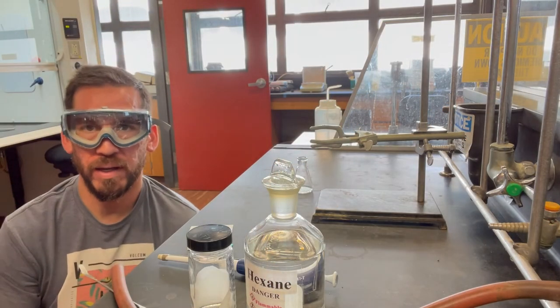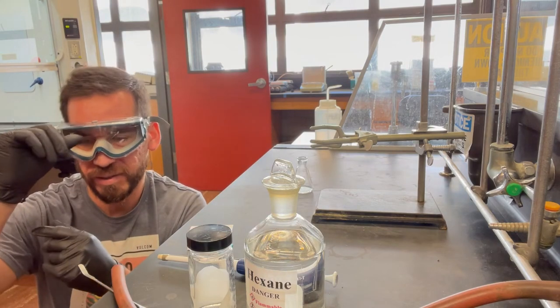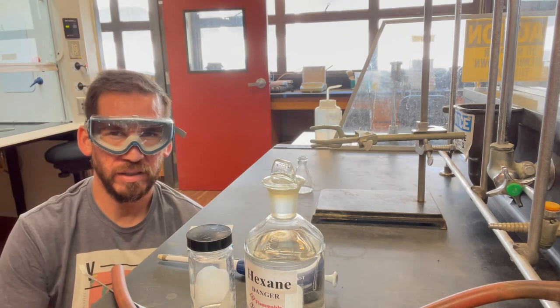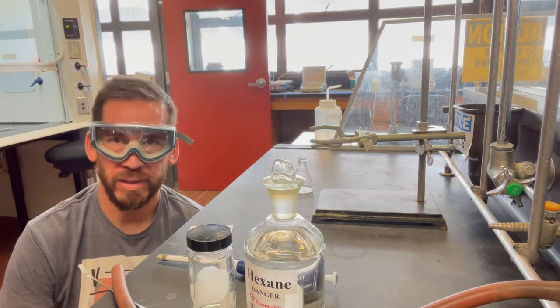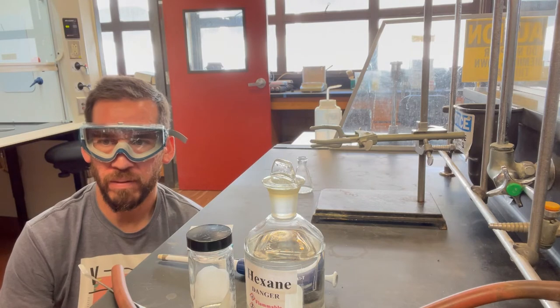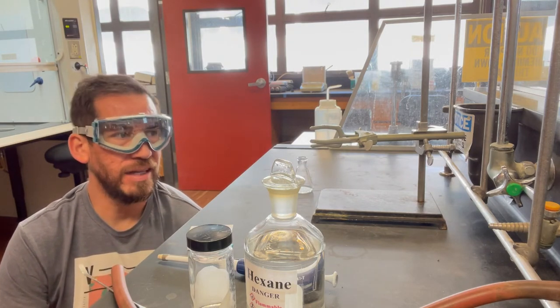Okay, so I have the solid material with the filtrate in that filter flask. What we're gonna do is, there's a little bit of sodium chloride. Let's see. Yeah, we used sodium ethoxide, right? And we had the benzyl chloride. So, there's sodium chloride salt left in that solid material.